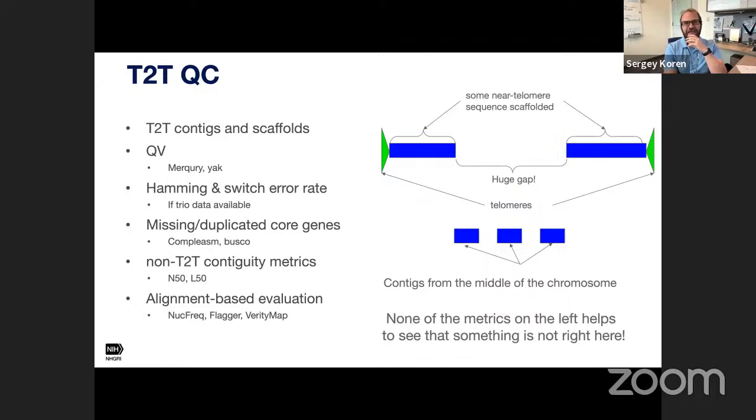So really what I want to say is that these kind of QC metrics are just the bare minimum. So you should run all these kind of tools and evaluate them. But just because those don't show a problem doesn't mean your assembly is perfect. There's still ways to have these kind of edge cases. And so you still want to make sure and sanity check the assembly. You want to look at the assembly graph, which I'm going to go through at the end after these slides when we go back to the command line. You want to make sure that there's not sequences that should have been placed where they weren't, and so on, and just kind of spot check and sanity check the assembly afterwards. Don't assume just because these kind of standard QC metrics don't indicate a problem, there isn't one.